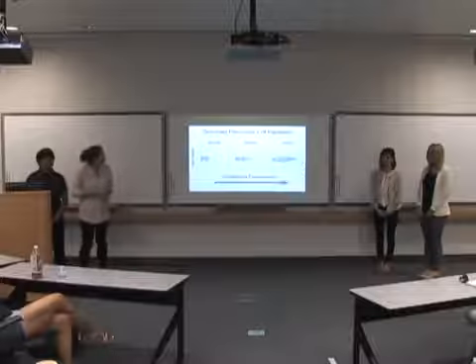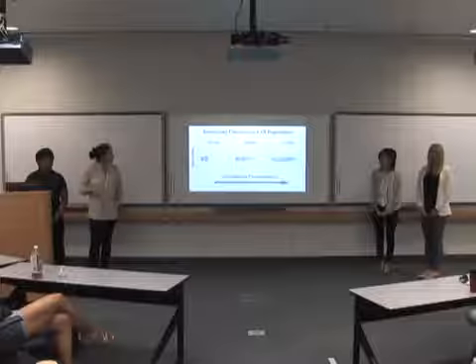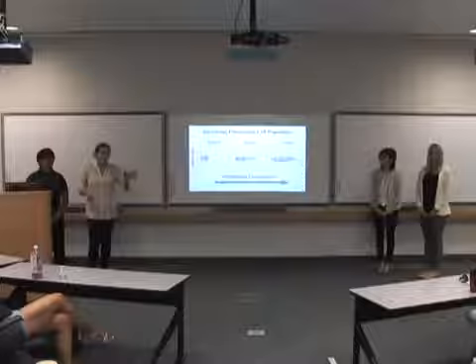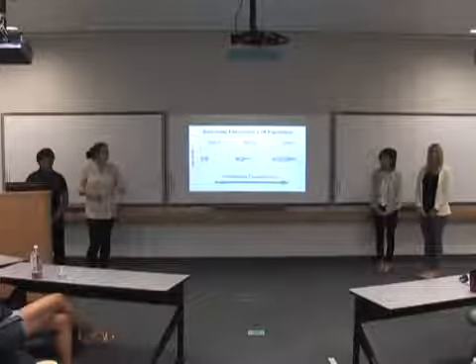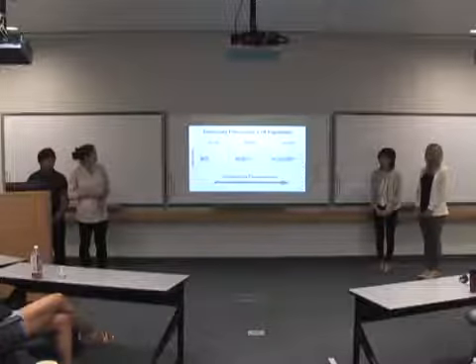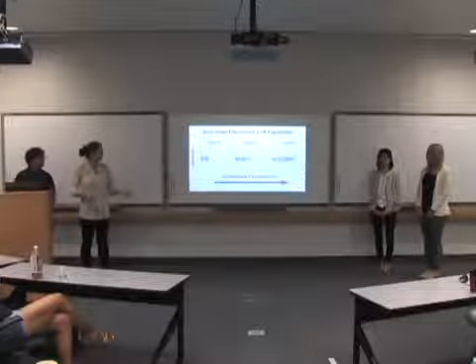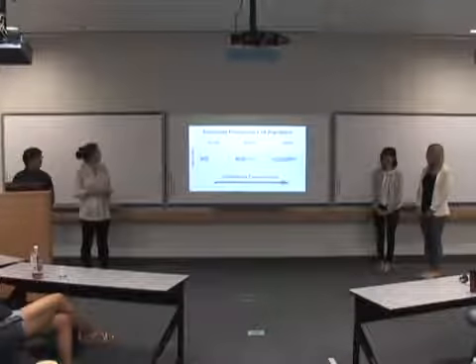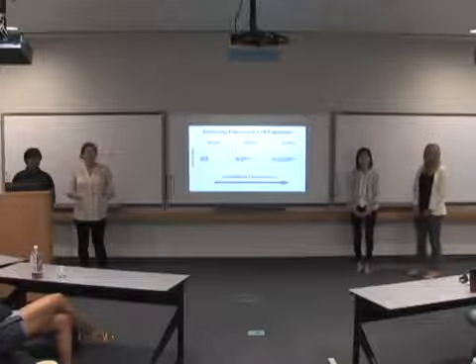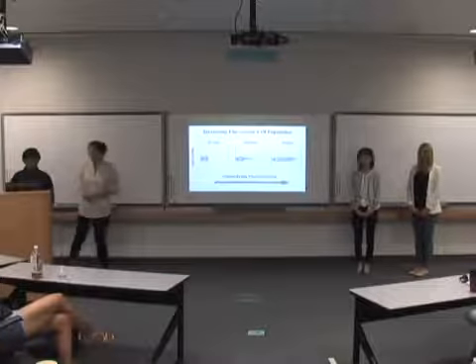And so you can see here that the population of fluorescing cells is significantly higher than the first one, and we took it down from that 30,000 to about 3,000 cells. So then we went another time and repeated the process for a third sort, and then we got about 60% of the population to express these peptides and fluoresce. So pretty much with every sort that goes on, we're able to enrich the population with E. coli cells that have these expressed proteins that the antibodies would like to bind to.